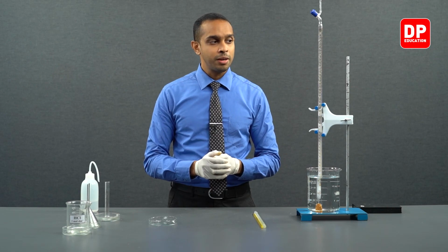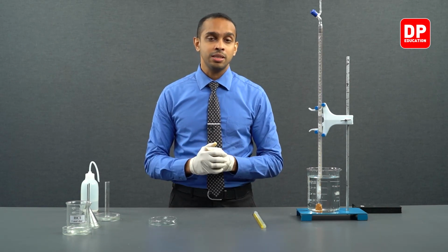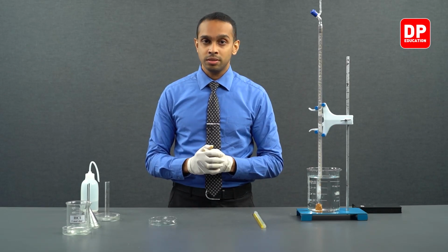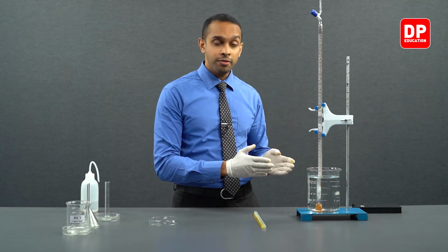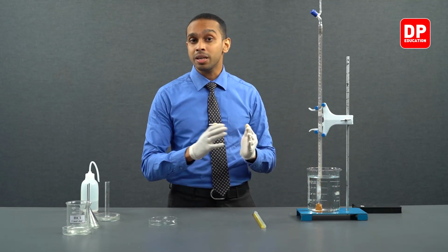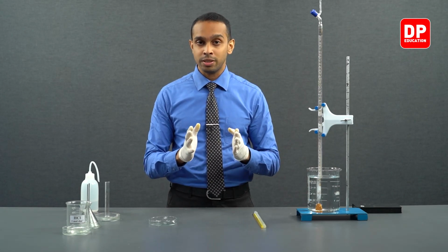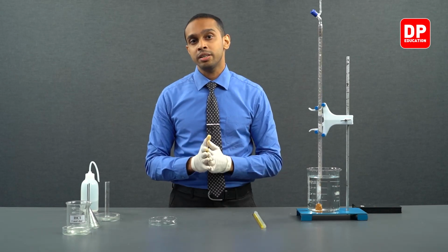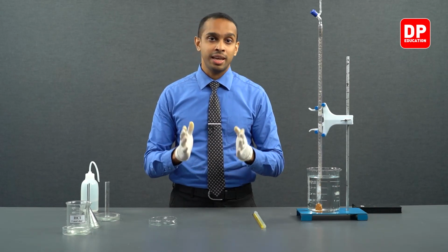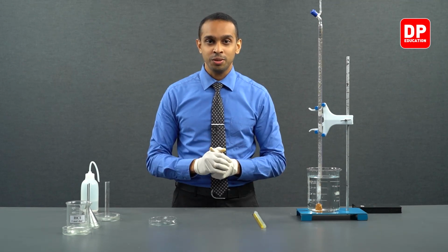This reaction will take place for a while, so we'll allow the reaction to take place for a duration of about 10 to 15 minutes, and we will observe whether the magnesium strip has completely reacted. At the point at which we do not observe the presence of the magnesium strip, we will take the burette reading, and that will serve as our hydrogen gas volume for calculations. Let's allow the reaction to go to completion.